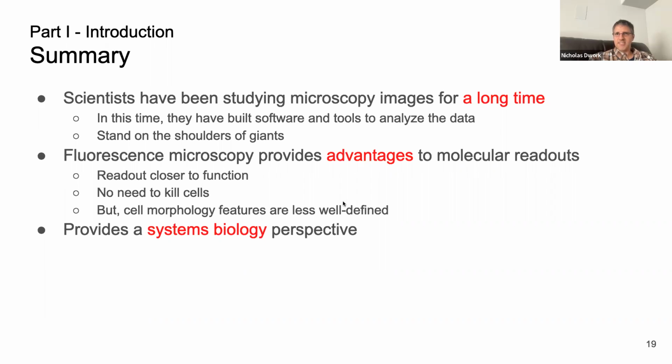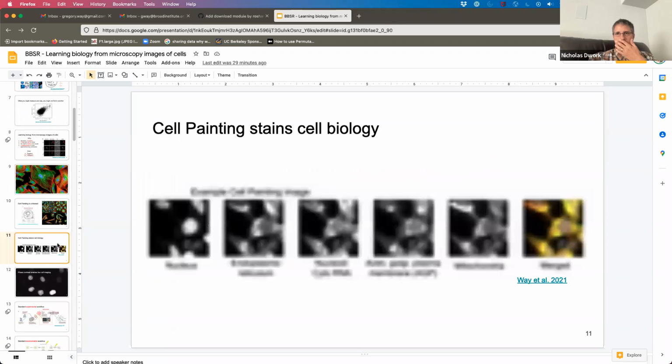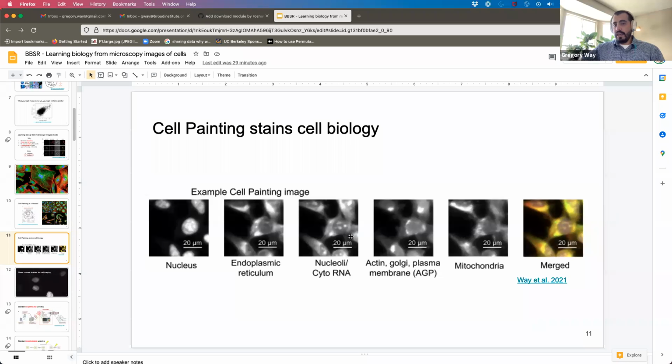I have a question. Great. I'm curious if you know about the merging of the individual fluorescence channels into a single color image. You showed 5, if I remember right. And to my naive understanding, it would seem like you're losing information going from 5 individual channels to 1 color image, which has just 3 channels in it. Yes, so we don't analyze this merged representation. We analyze these 5 separately. And this merge is just for writing papers and putting nice figures in grants and stuff. Yeah. Thank you.